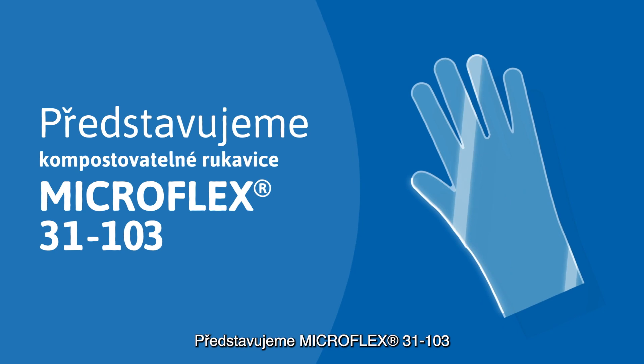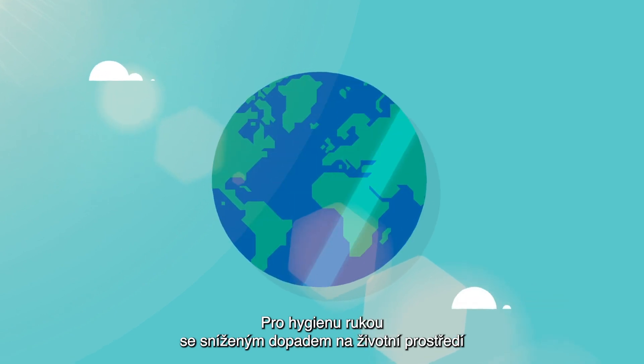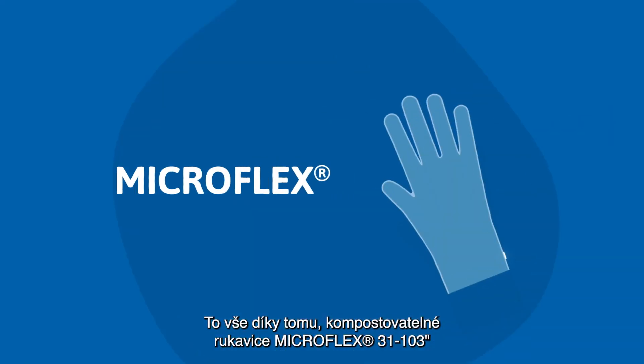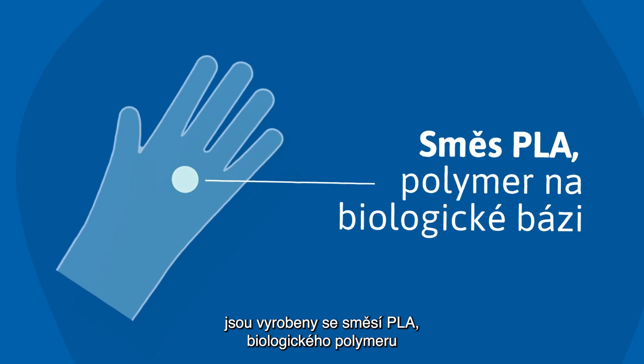Introducing Microflex 31103, Ansell's first compostable glove for hand hygiene, with a reduced impact on the environment compared to other disposable gloves. That's because Microflex 31103 compostable gloves are made with a PLA blend, a bio-based polymer made from natural renewable materials like plant-based sugars.